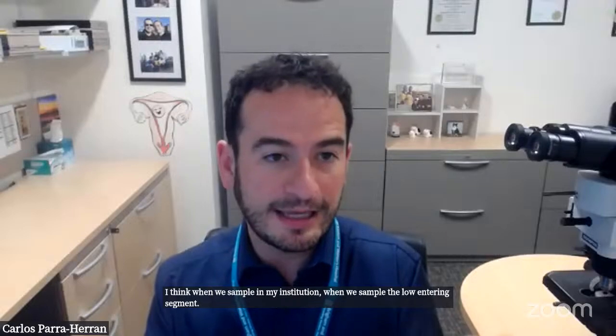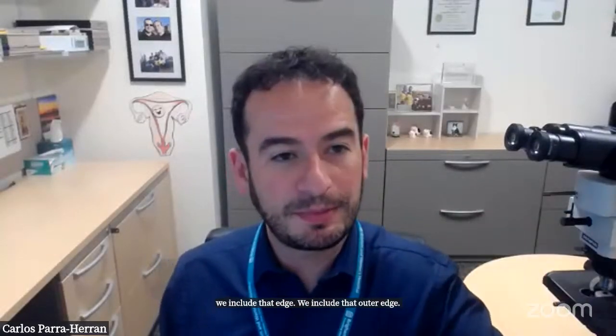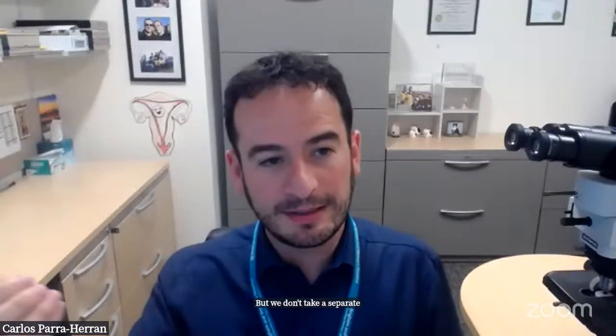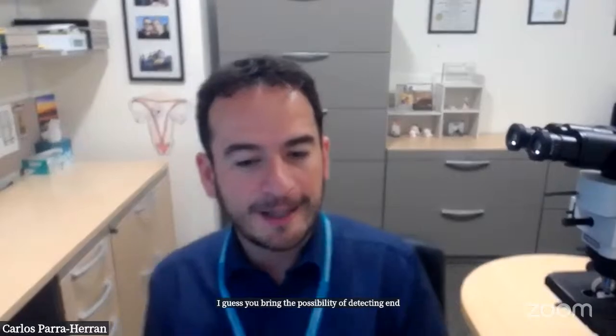When we sample the lower uterine segment in my institution, we include that outer edge, but we don't take a separate shaving or a separate section from that area.